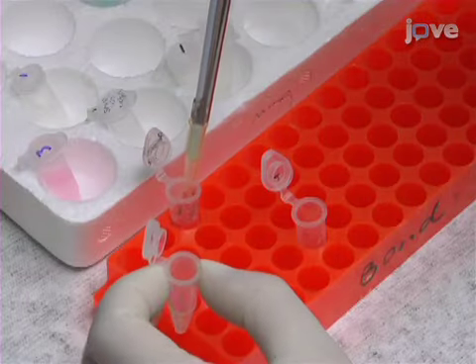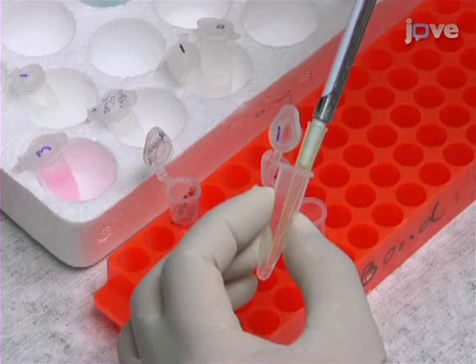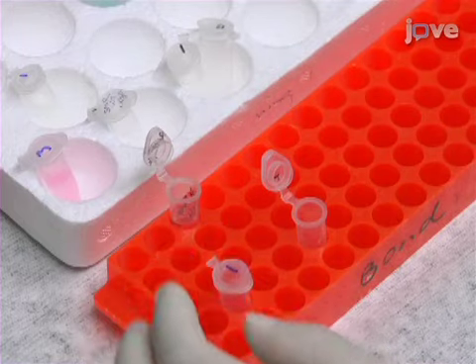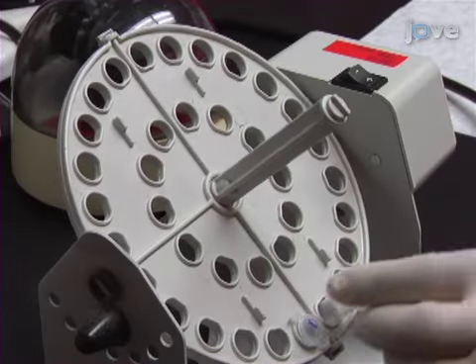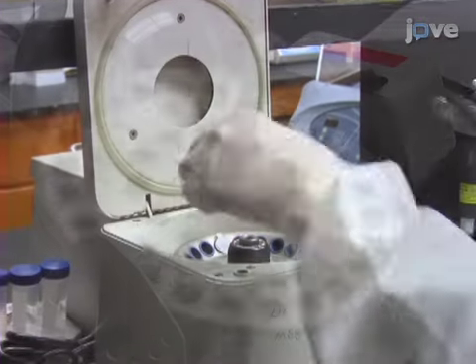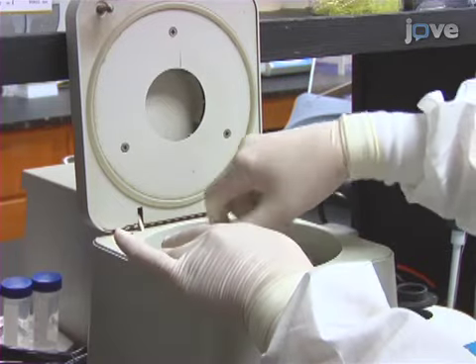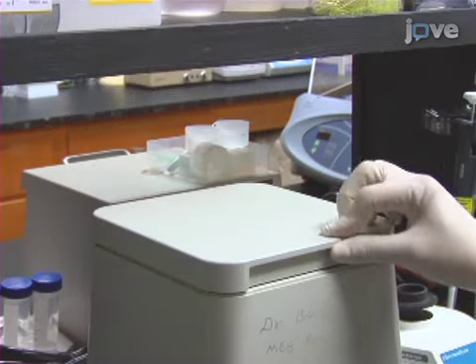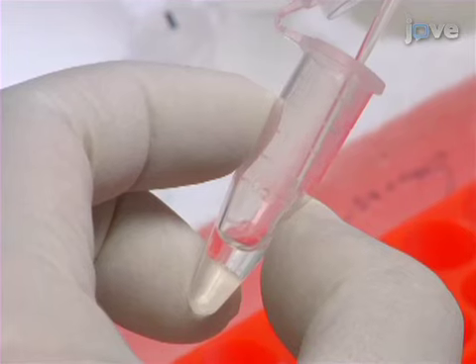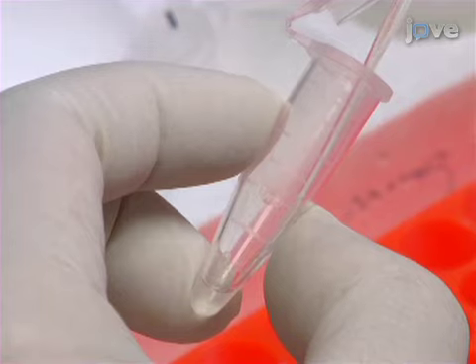To elute the bound cellular proteins, add 15 micrograms of excess 3X flag peptide to the tube in 50 microliters of wash buffer and incubate on a rocker shaker for 30 minutes at room temperature. After the incubation, centrifuge at 5000 to 8000 times G for 30 seconds. After allowing the tubes to settle for 2 minutes, collect and save the supernatant containing the eluted proteins.